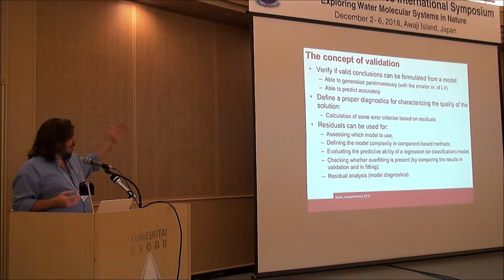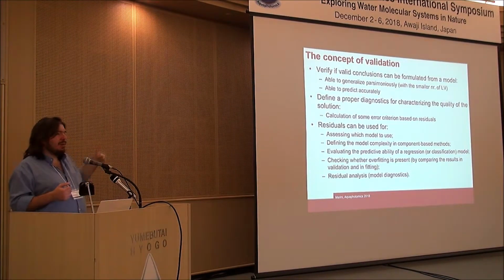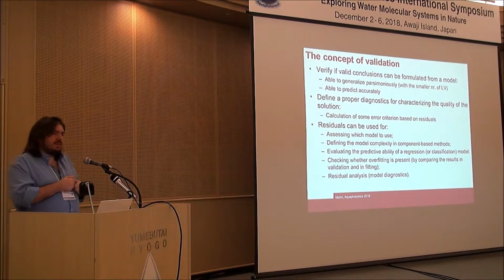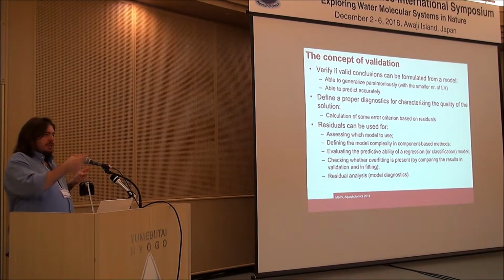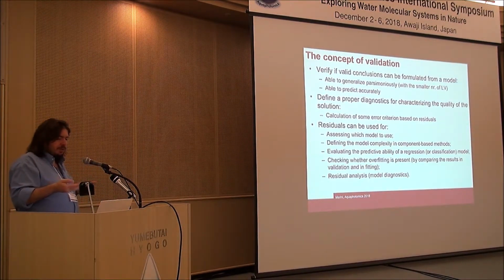Because residuals have many properties that you may see there, and they may be important in helping us assess which models to use. In components-based methods, they may help us to define the optimal complexity of the model to use.